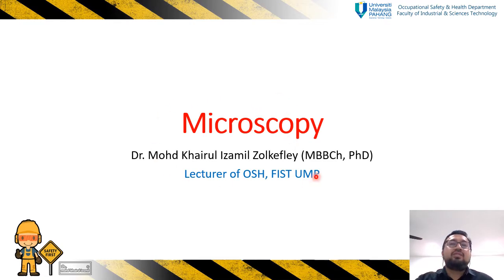This topic is also important because when you see a picture, you know what kind of microscope they used and the mechanism. And how a sample can be viewed, and we can diagnose certain diseases, especially occupational diseases which relate to microorganisms. So microscopy is part of a topic where you don't need to know in great depth, but you know the basic knowledge of it.